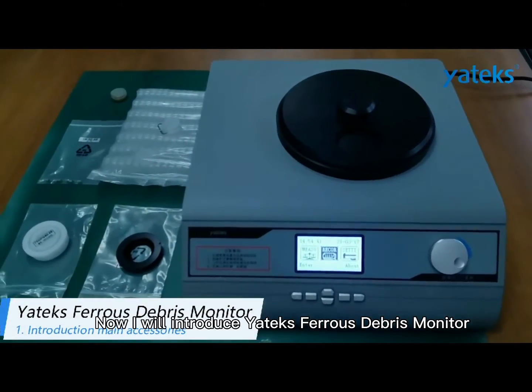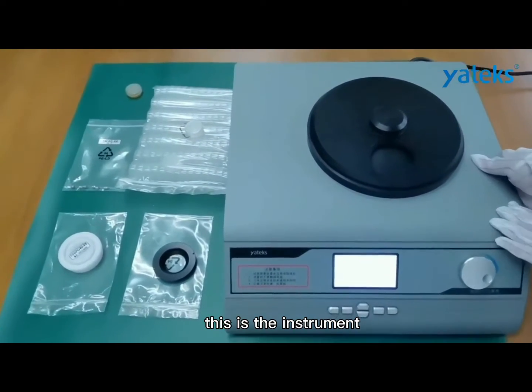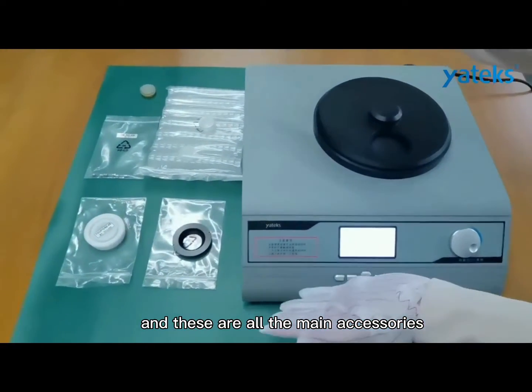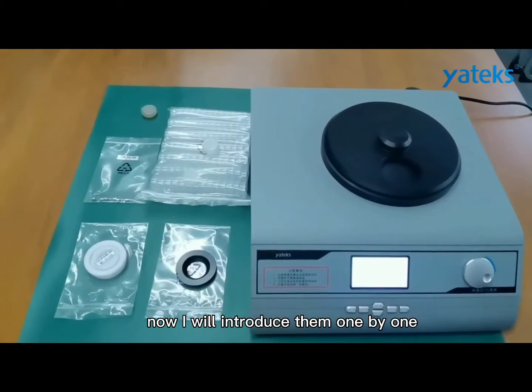Now I will introduce the Yateks Ferrous Debris Monitor. This is the instrument and these are all the main accessories. Now I will introduce them one by one.